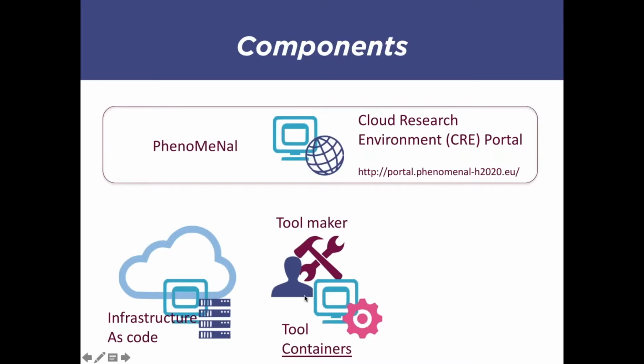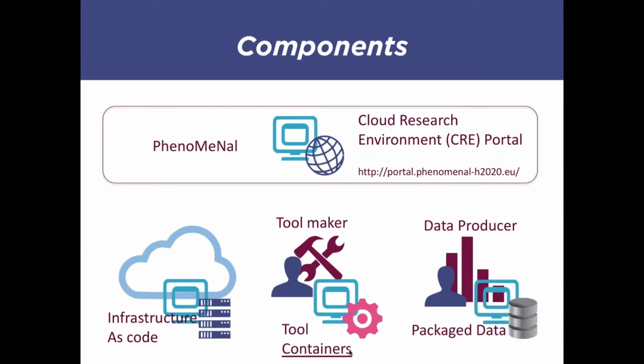Of course, to be able to run the tools on top of this infrastructure that we create for you, we had to package tools in a certain way so that they can be seamlessly run on top of this infrastructure. And for that, what we did is we containerized a number of metabolomics data analysis tools that are relevant and that people tend to use these days. And I will go later into the detail of how many tools we have and how they are organized in the metabolomics analysis space.